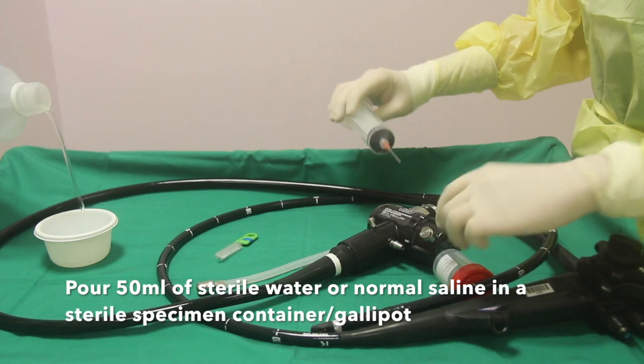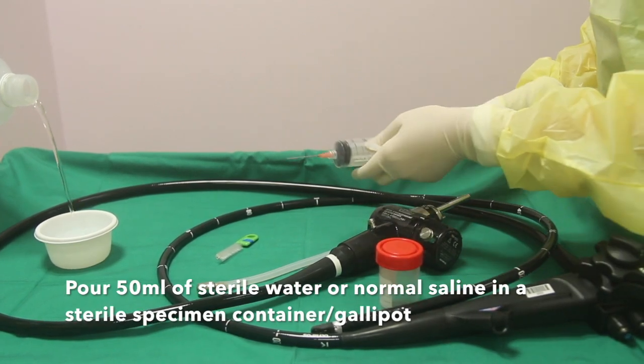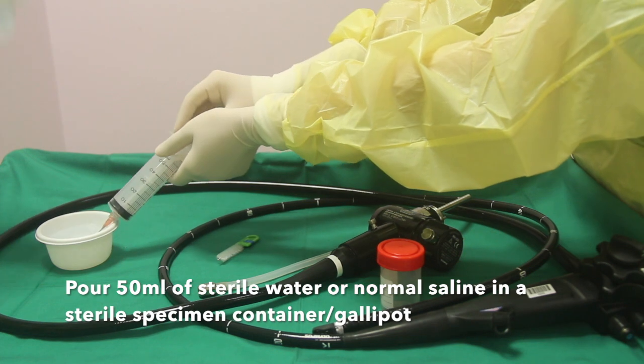Pour 50 ml of sterile water or normal saline into a sterile specimen container or gallipot.